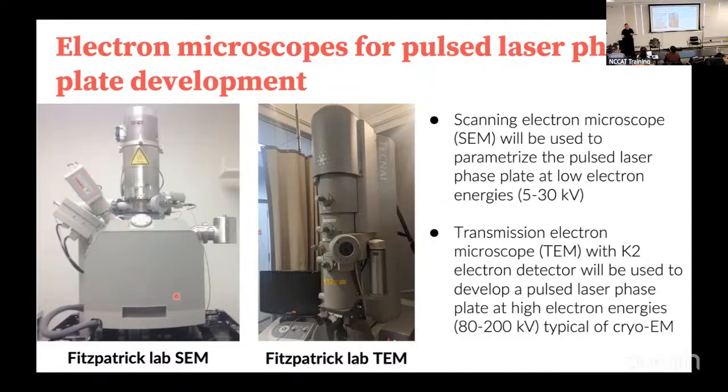And so we decided that we would start off with this because it's also lower energy. This was the entire set of optics that we bought to begin the project. For the laser, these are lenses, mirrors, things called periscopes, telescopes. These are just paths that you send the laser through.